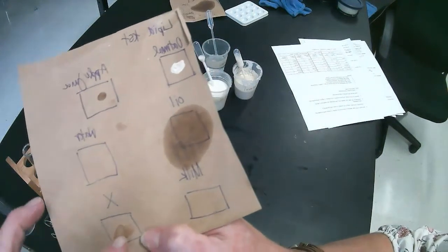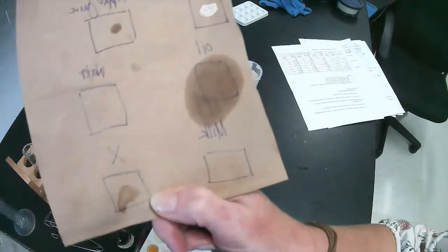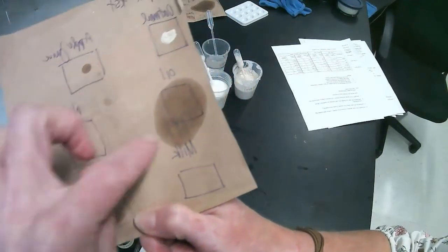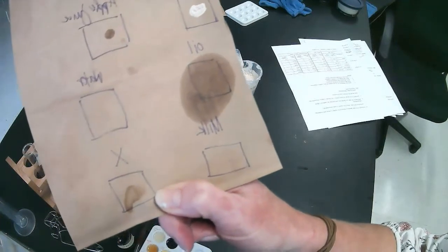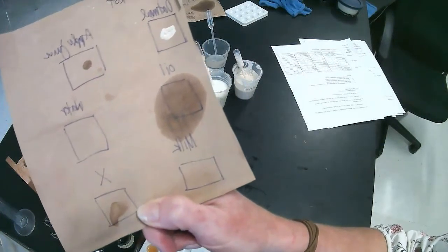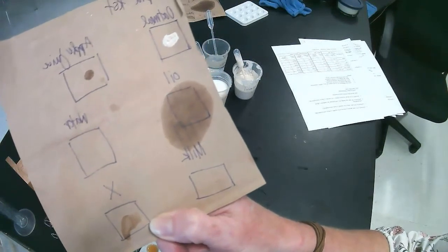Our X factor, I think that it just dried. It's not really absorbed into the paper. It's sitting on top of the paper. So I'm going to say that the unknown substance is also negative for lipids.